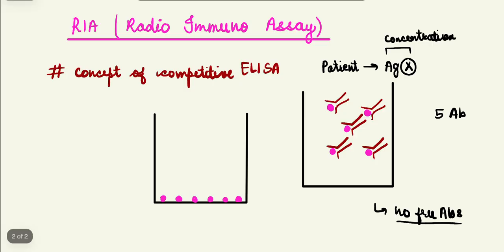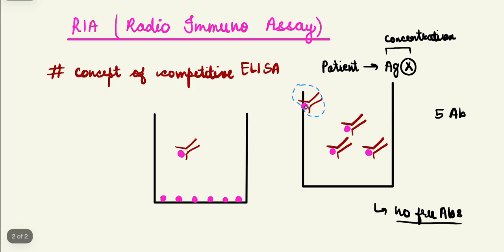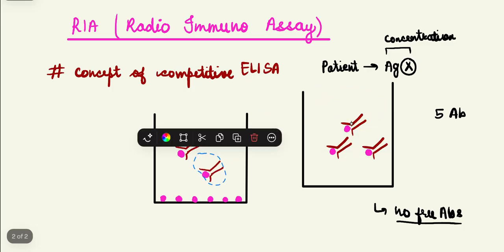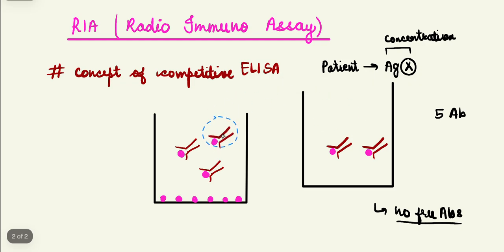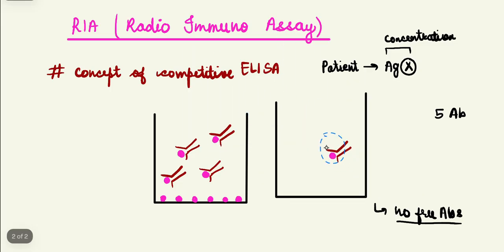Now this has been done. We will introduce all of this into the well. Suppose I'm introducing this, then this, then this and this. So I've emptied it entirely and introduced everything into the well.